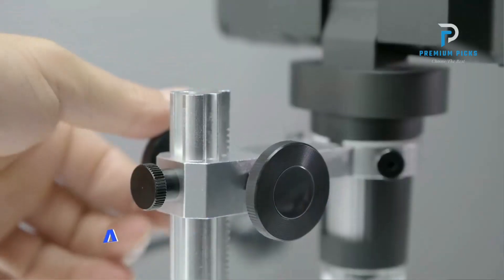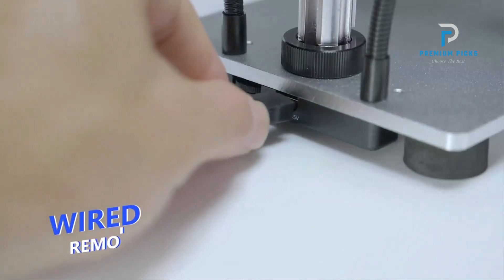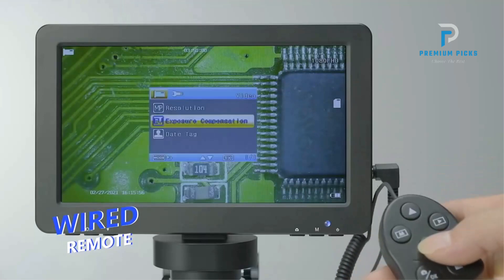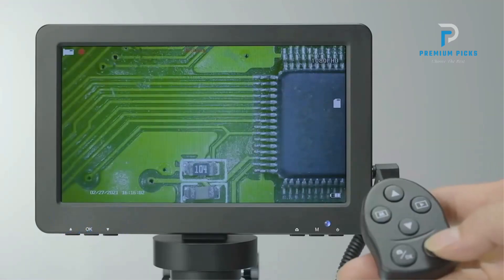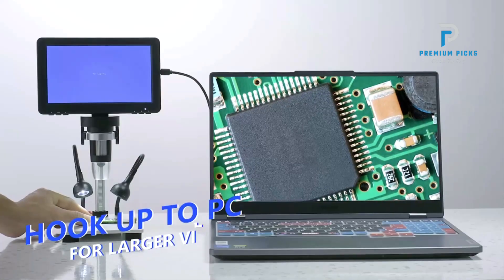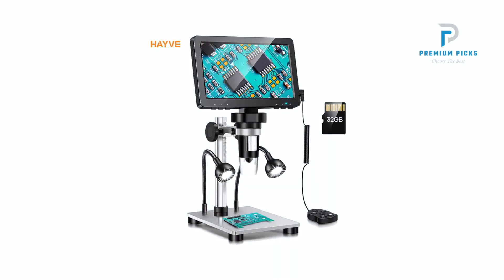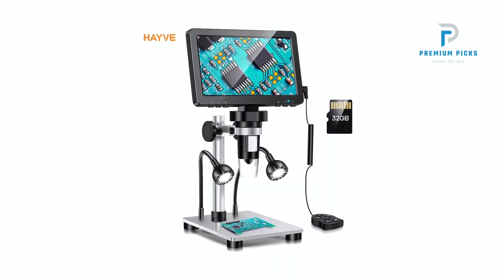With a maximum pixel resolution of 1080FHD and a 12MP HD electronic camera, this microscope delivers crystal-clear imagery with stunning detail. Its 1500x zoom capability allows for precise examination of even the tiniest objects, making it ideal for soldering, phone repair, and various scientific applications.